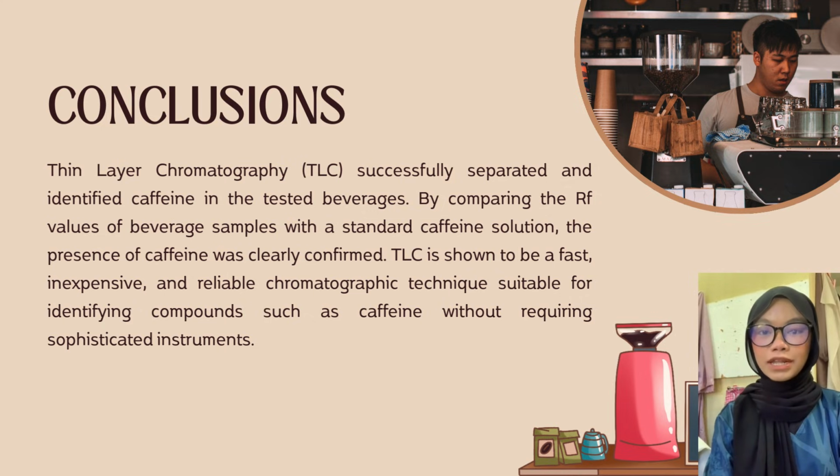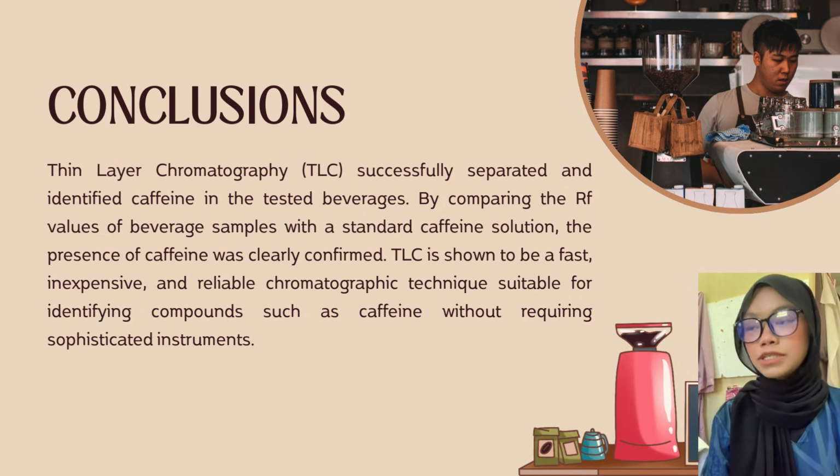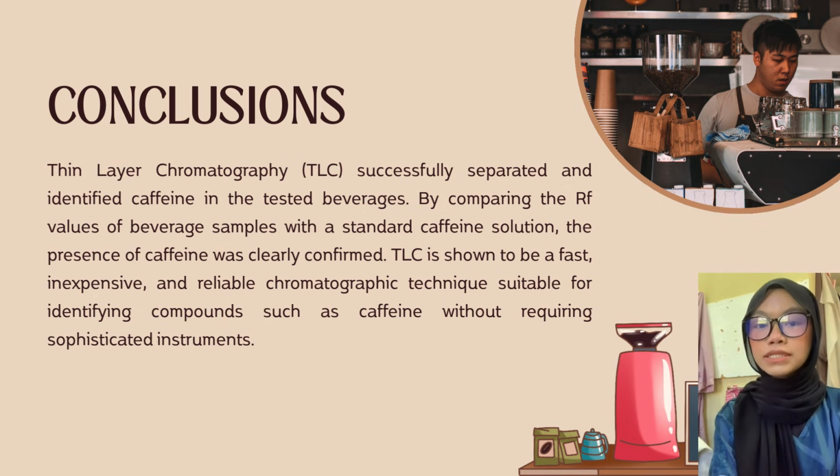My name is Nur Nazira, and the last part is the conclusion. Thin layer chromatography, TLC, successfully separated and identified caffeine in the tested beverage. By comparing the RF values of the beverage sample with a standard caffeine solution, the presence of caffeine was clearly confirmed. TLC is shown to be a fast, inexpensive, and reliable chromatographic technique suitable for identifying compounds such as caffeine without requiring sophisticated instruments. That's all from us.